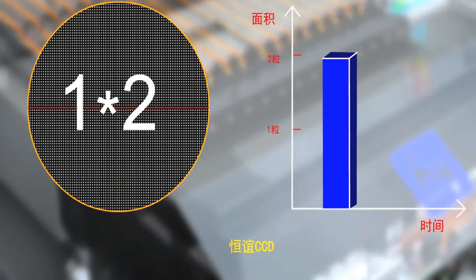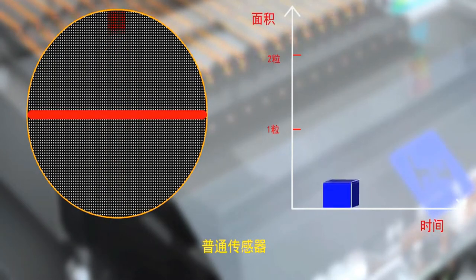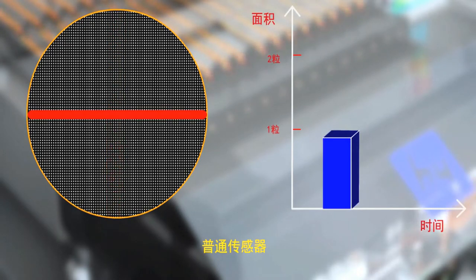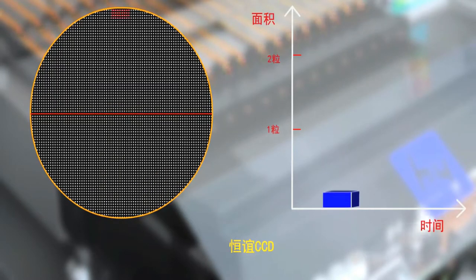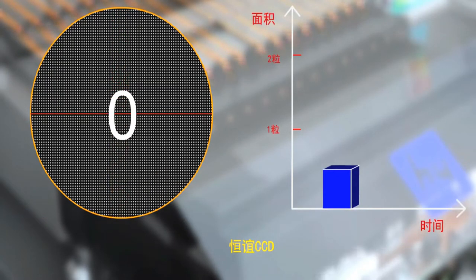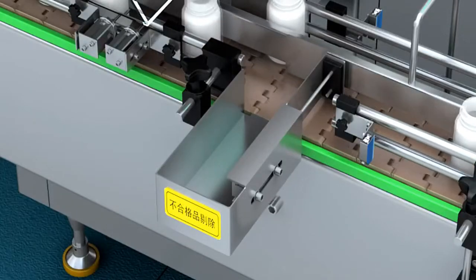Third, when broken tablets enter the counting sensor, the counting of the common counting machine is 1. The counting of Heng Yi equipment is 0 because it isn't in normal area range, and Heng Yi will automatically reject it.